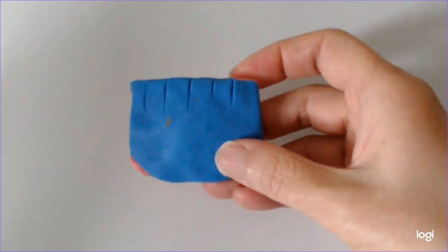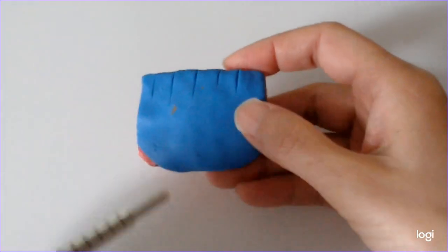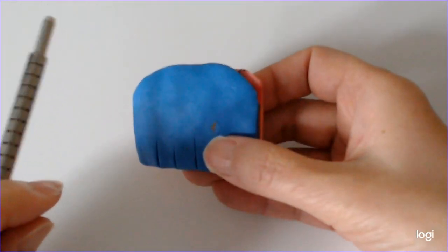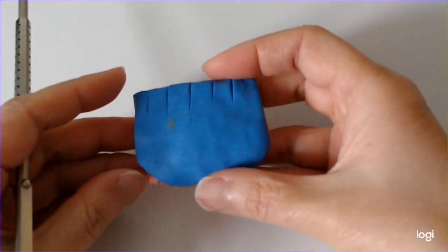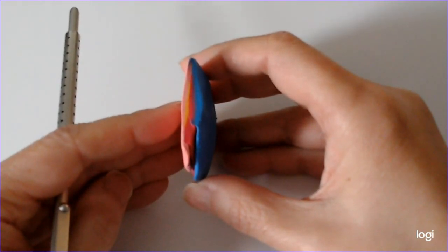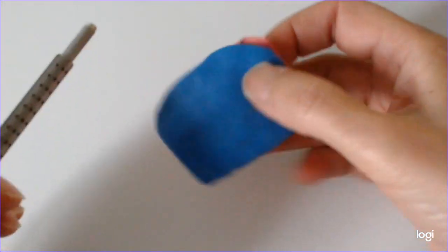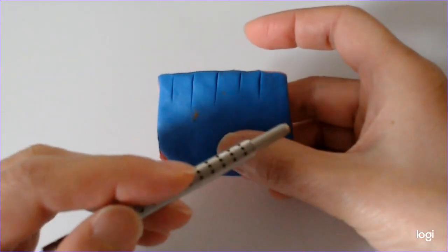We're interested in the medial and lateral margins, as well as the inferior or superior margins, depending on whether it's an upper or lower eyelid. My personal preference is to examine the specimen in the sagittal orientation, which is how you usually see cross-sections of the eyelid in textbooks. This way I can directly measure tumour distance to the superior or inferior margin, but not to the lateral or medial margins.